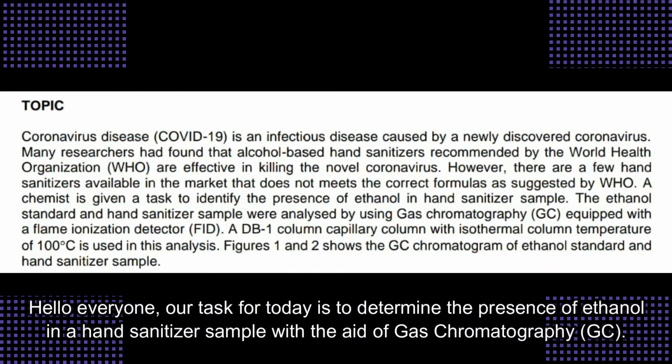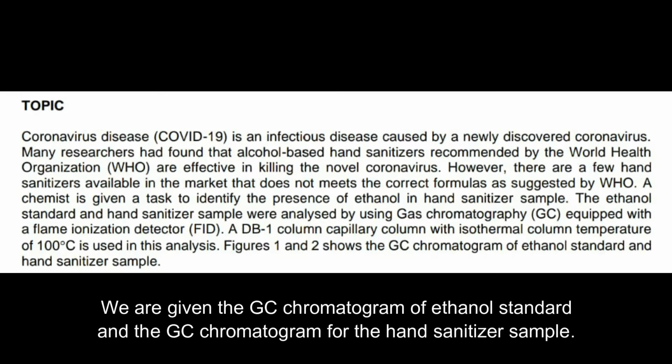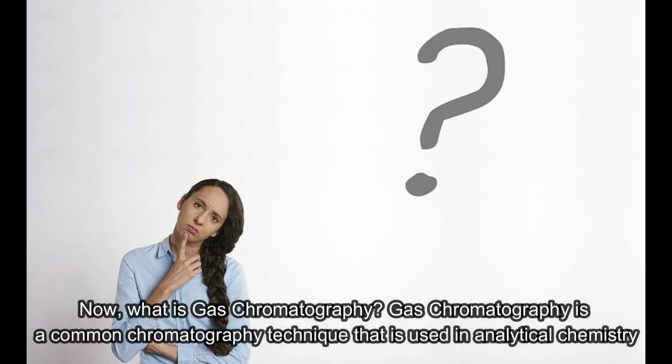Hello everyone. Our task for today is to determine the presence of ethanol in a hand sanitizer sample with the aid of gas chromatography. We are given the GC chromatogram of ethanol standard and the GC chromatogram for the hand sanitizer sample. Now, what is gas chromatography?